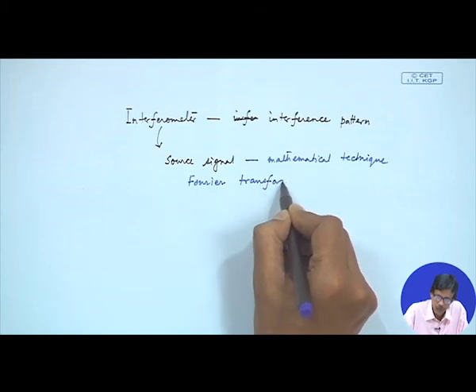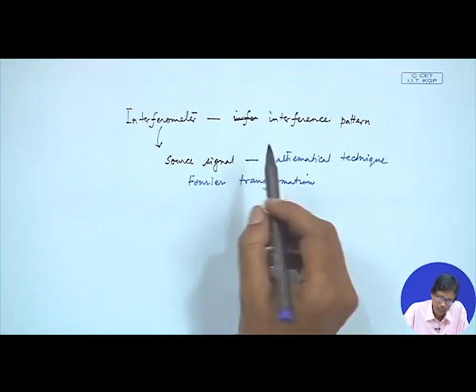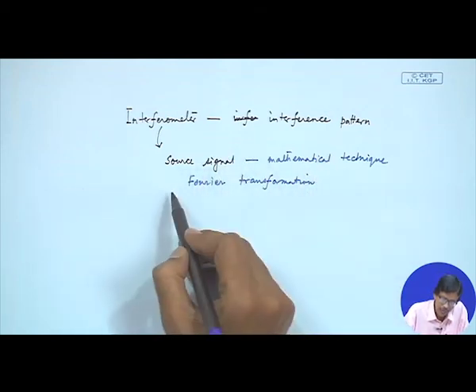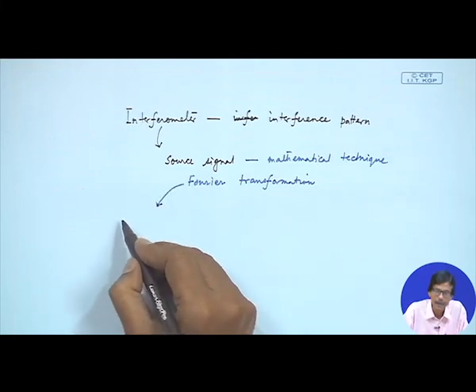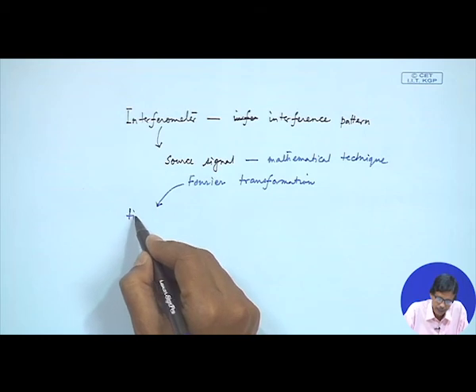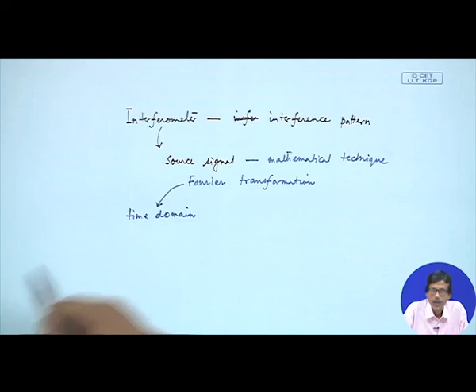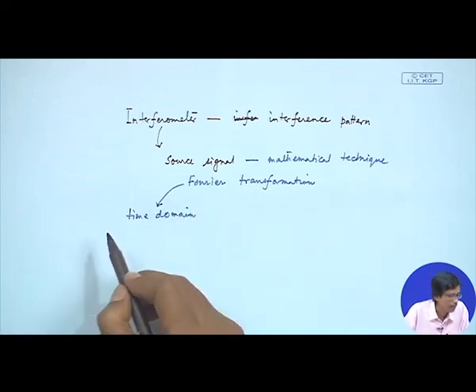This is the important thing, that we can measure everything, that means all wavelengths together, and we basically get the spectrum as a time domain spectrum, where we plot the signal amplitude with time.